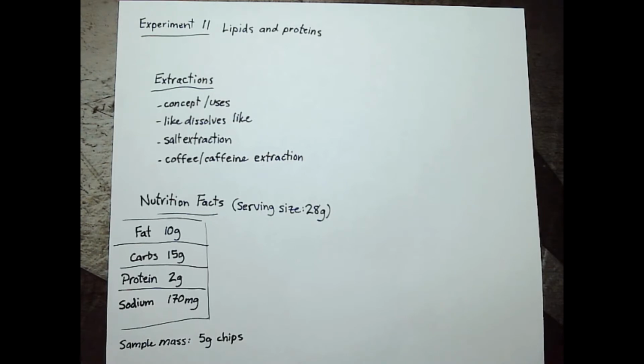So it should leave behind the potato starch, which is the carbs, the salt, and the protein. Petroleum ether is also able to evaporate completely, so it should leave behind only the oil and not contribute any weight to the oil once it's all gone. Then for the calculations, we'll be weighing the separated oil and we'll be weighing the mixture of everything else. That mixture left behind after the oil is removed will be made up of the carbohydrates, the protein, and the salt content.